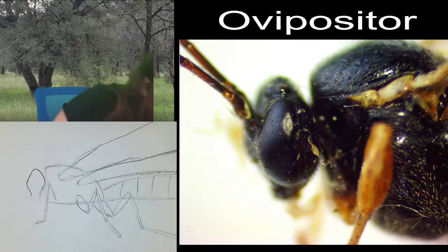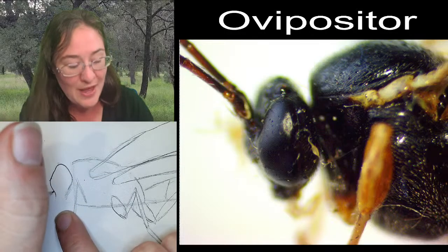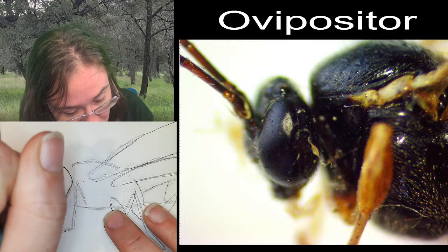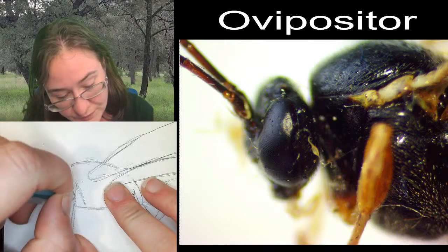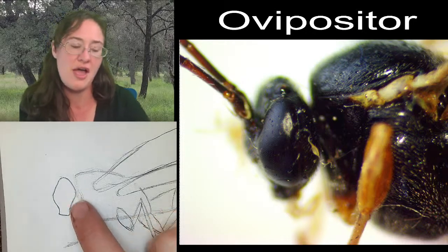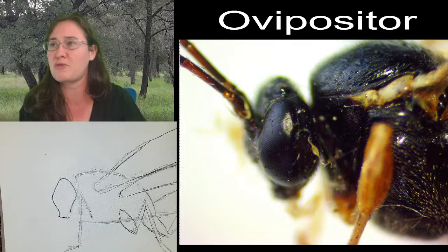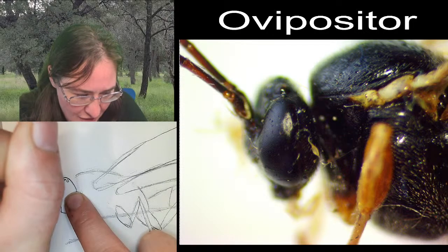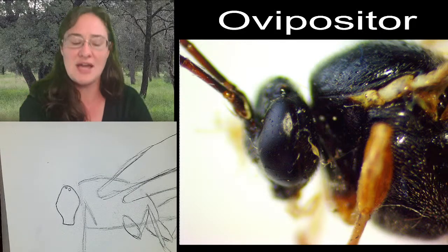There we go. Now it's a little bit closer to the screen. So it rounds back in, and then you have this region right about there, that's going to be where her mouth parts are. All right, so that's going to be our overall head shape here. We're probably also going to zoom in even closer so that we can add detail to the mouth parts. But first, I'm going to put these ocelli up here at the top. I just have the space for the one that's close and the one in the middle. The one on the other side is not going to be visible.